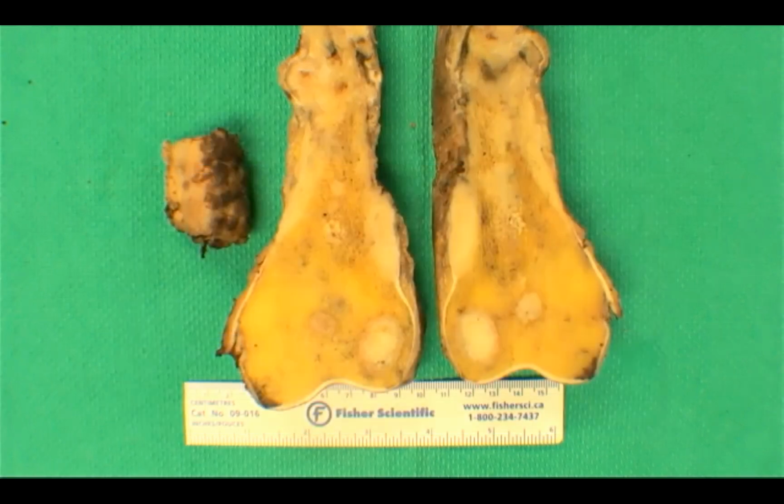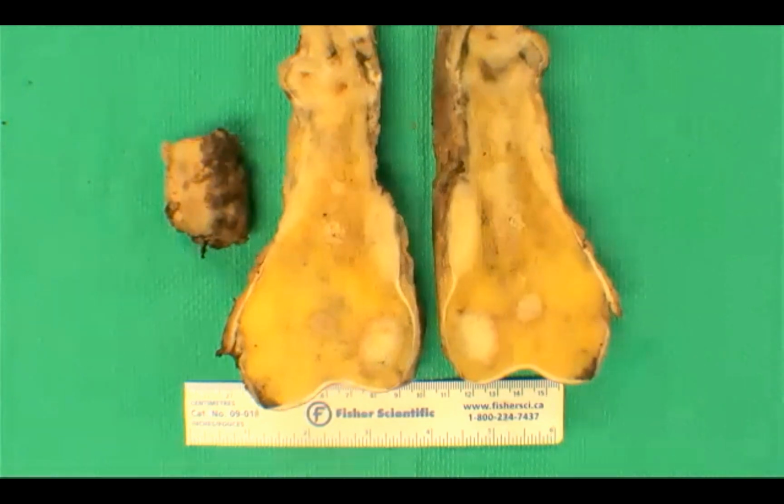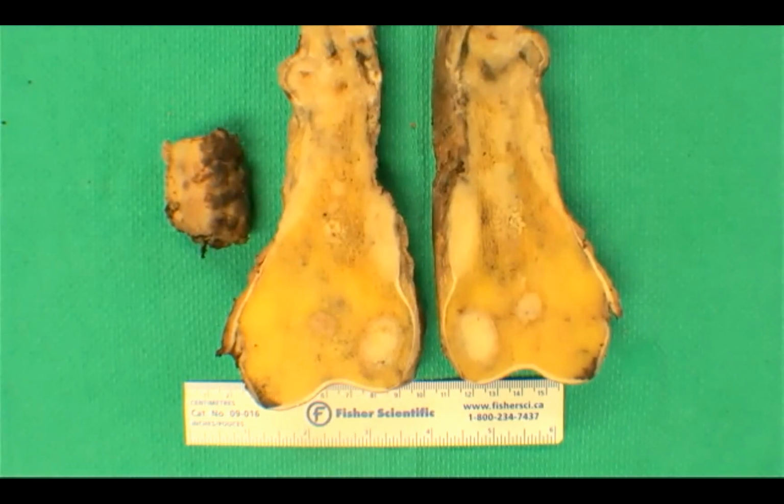The challenge with this is, in theory, you should be doing one block at a time because you want to be able to optimize the decal period specific to the amount of calcium in each cassette. So you can imagine if you were decaling a number of different blocks, this would be even more challenging than it already is. We use X-ray here. It's really great. Basically, we're looking at the bone in the cassette change from being radiopaque to radiolucent. And for the no idea folks, I encourage you to go talk to some of the histotechs involved or whoever's responsible for your decal and find out what your process is locally.